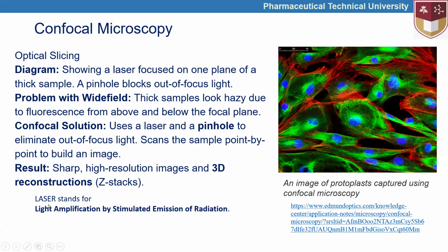Let me tell you that laser is the abbreviation of light amplification by stimulated emission of radiation. It can have different ranges of electromagnetic waves. We often use the red-colored laser in biomedical research. Yeah. So this is about confocal microscopy.